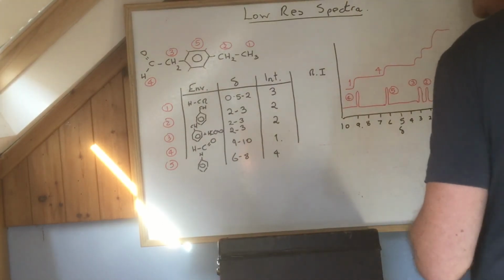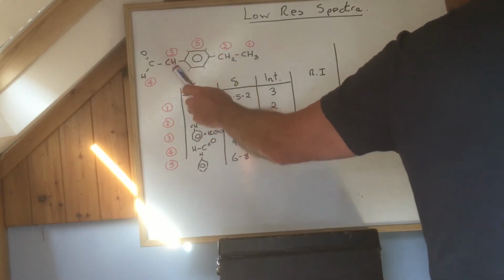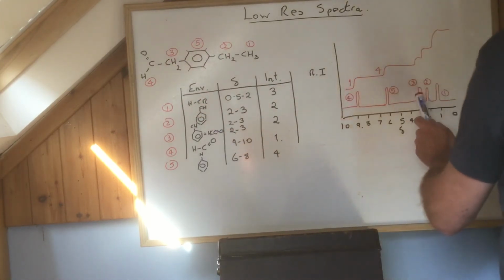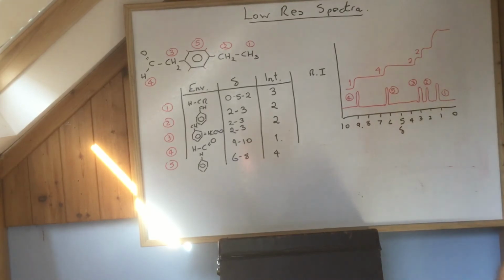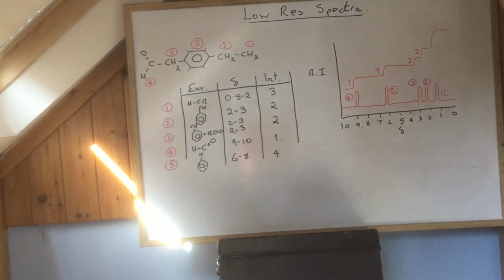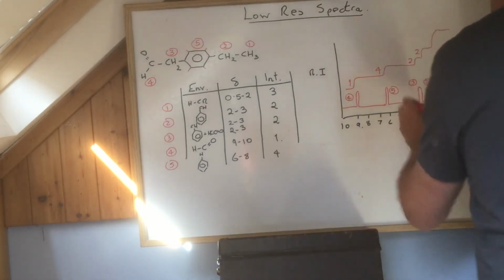Then I've done that. Then we've got these H's joined to a C, which is joined to a benzene ring. Now, I don't know which way round and they're too close together, but basically 2 and 2. 2 in one environment, 2 in the other. Whichever way they are, 2 to 3, it doesn't really matter. Very close, maybe even overlaid, and there's a question whether I have to take that into consideration, because if one was slap bang on top of the other, you wouldn't see it. Okay, so we have to watch that a little bit. Anyway, I'm going to see the question, that'll make sense.